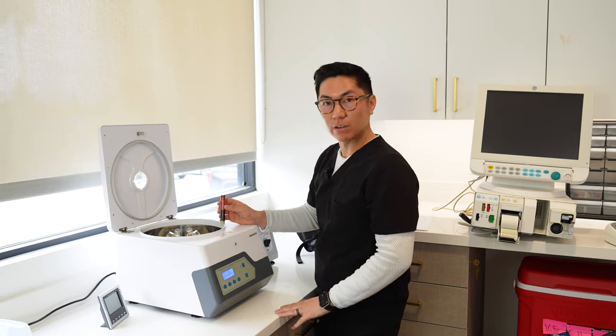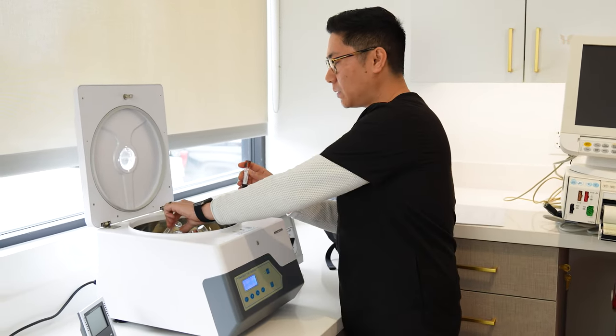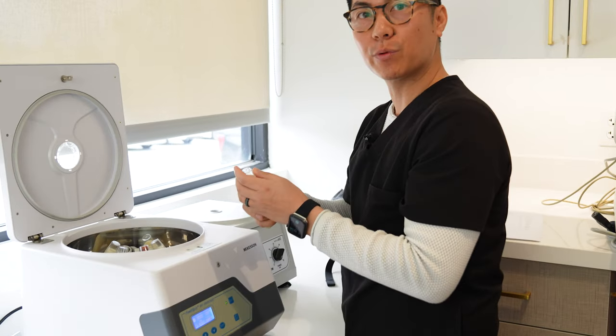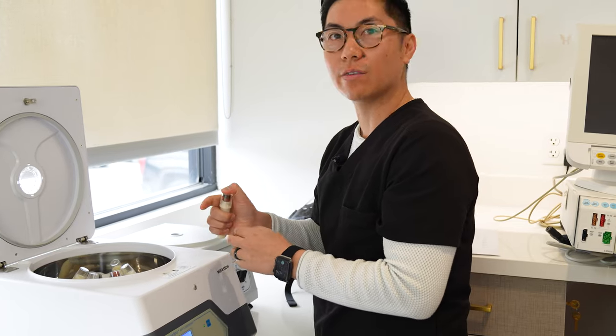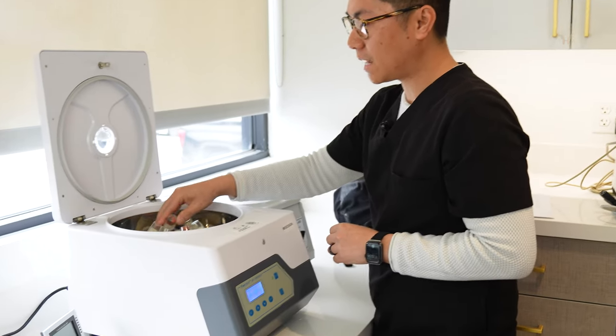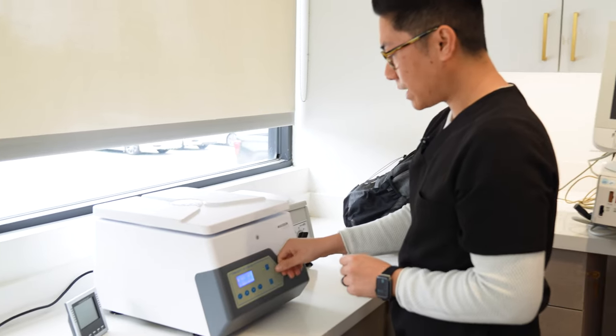So this is our centrifuge. What I'm doing here is I'm putting in a sample of blood. We're going to spin it down just so we can separate the red blood cells. For this test, what we really want is to separate out the serum, and we can run labs with that. We'll let this spin for about 10 minutes and come back to it in a second.